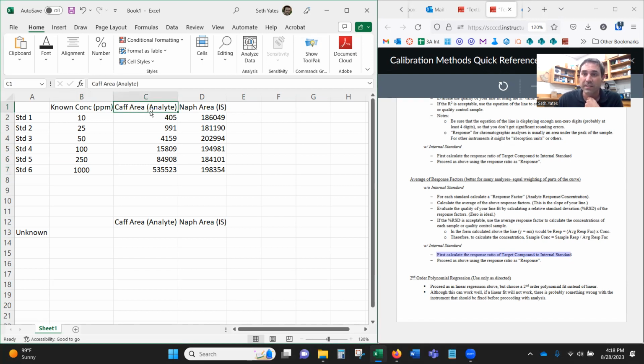When they were analyzed, they went through the gas chromatograph into the mass spectrometer detector, and these were the area counts for each of the analytes. For caffeine, the first one had an area count of 405. Gas chromatography data gives a constant readout from the instrument, increasing when caffeine is present and then dipping back down when caffeine is not present or when no compound is sensed.